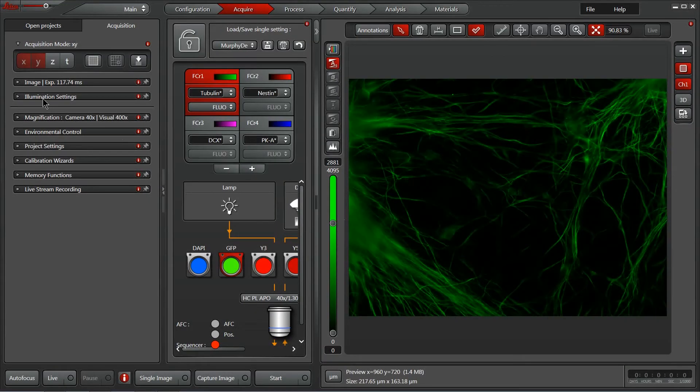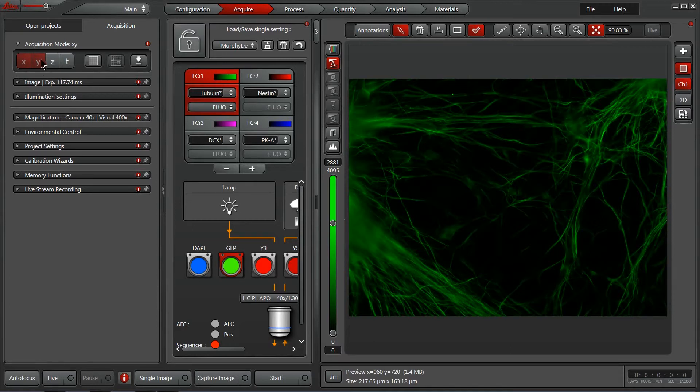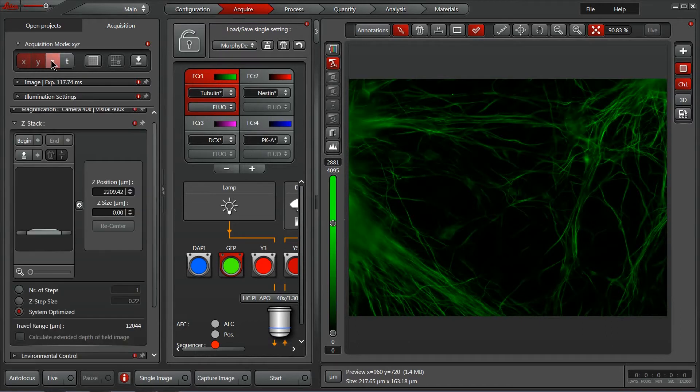Now that we have the illumination settings and exposure settings done for each of our four channels, we're going to be able to add some additional dimensions to our experiment. Beginning with a Z-stack, we can select a Z-stack within our acquisition modes part of our acquisition tab.